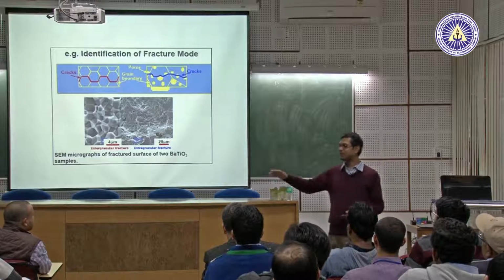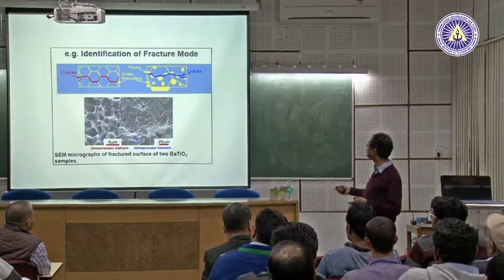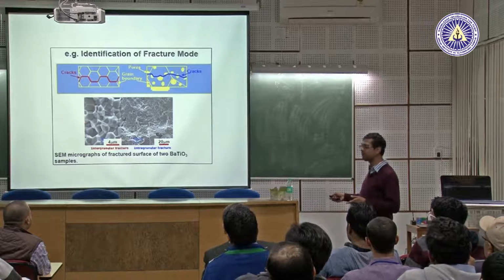You have seen river patterns or cleavage type fractures, okay? So this looks like that. There are pores, these are pores. You can see here, these are actually pores. And the crack has gone through one grain to the other grain. Otherwise, it could have looked like this.